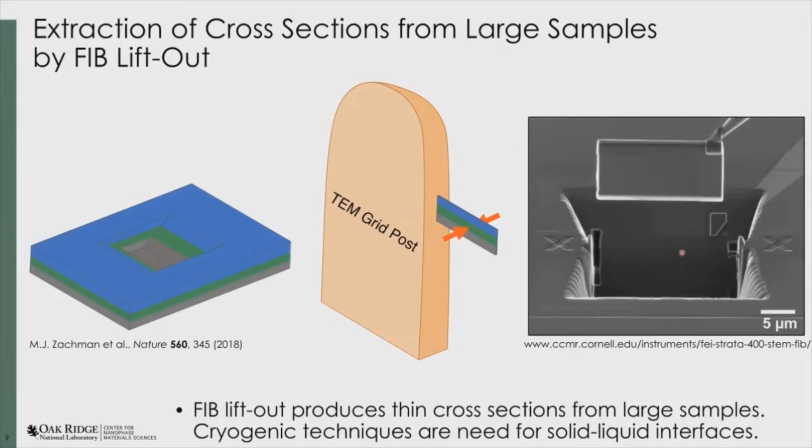But there are a couple of major problems with that. One is pretty obvious. The needle is at room temperature with standard techniques. You touch the room temperature needle to your sample and it will immediately melt if it has liquids. So we need to have a cooled needle. And the other one is a little more subtle, but it is actually a bigger problem.